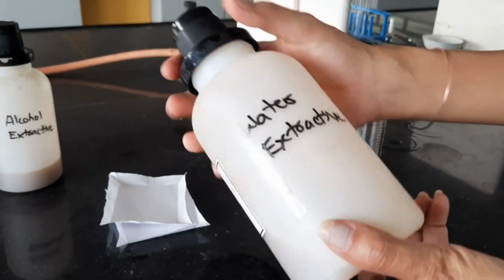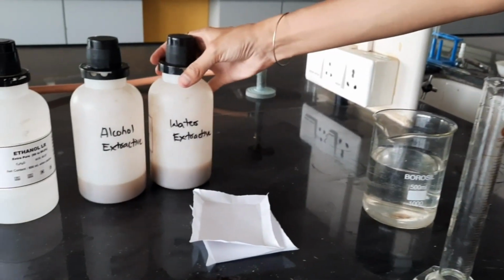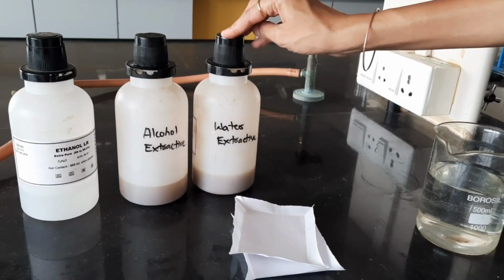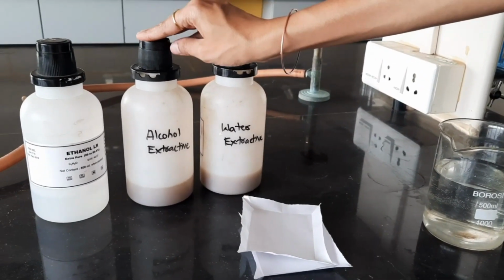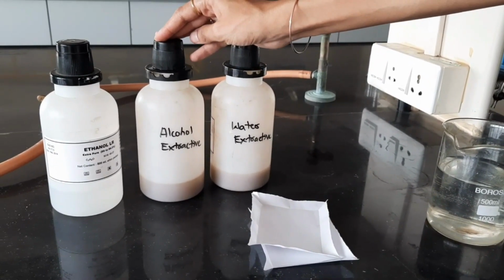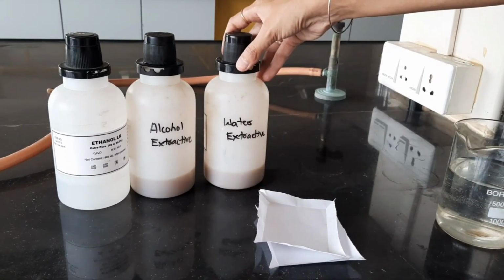And we'll shake it. After shaking for 6 hours, we will pipette out 25 ml from water extractive and 25 ml from alcohol extractive, and we will evaporate both of them, and we'll note down the extractive value for alcohol extractive and water extractive.